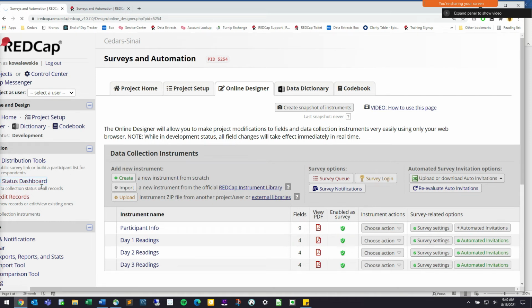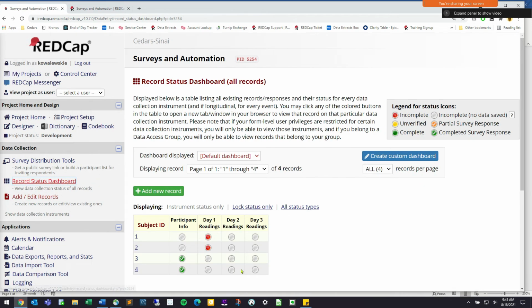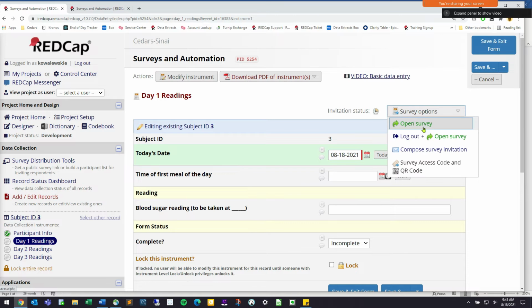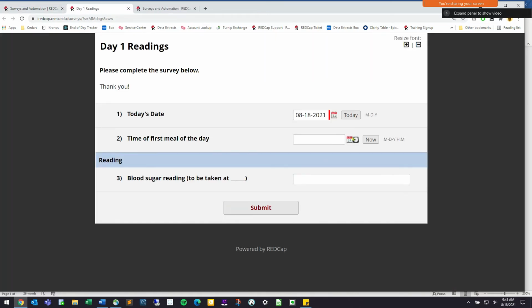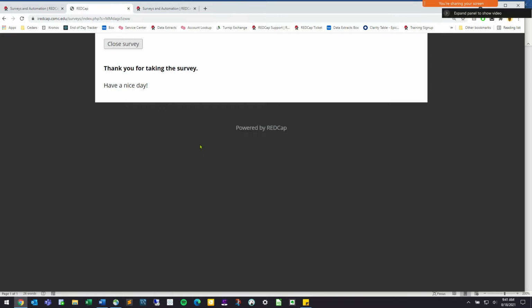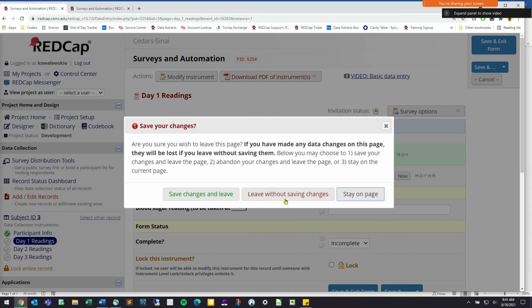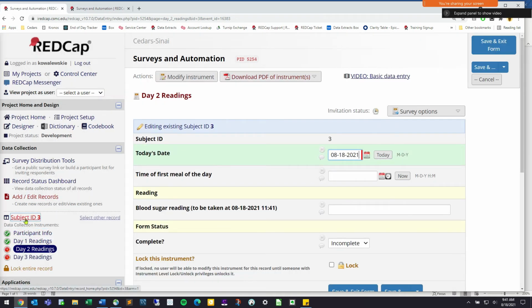And just to kind of show this in action, I'll speed up time a little bit here and see if we can force day 1 survey to be completed for this participant. So I'll open this guy up and just say, let's say the first meal was taken at 9:41, so the reading should be at 11:41, and let's say the blood sugar level was 190, something like that. And I'll hit submit. And now that they've completed day 1, day 2 should be scheduled and ready to go.